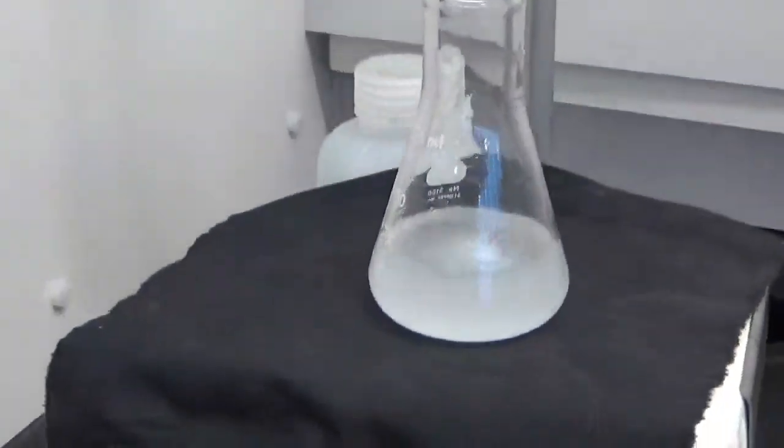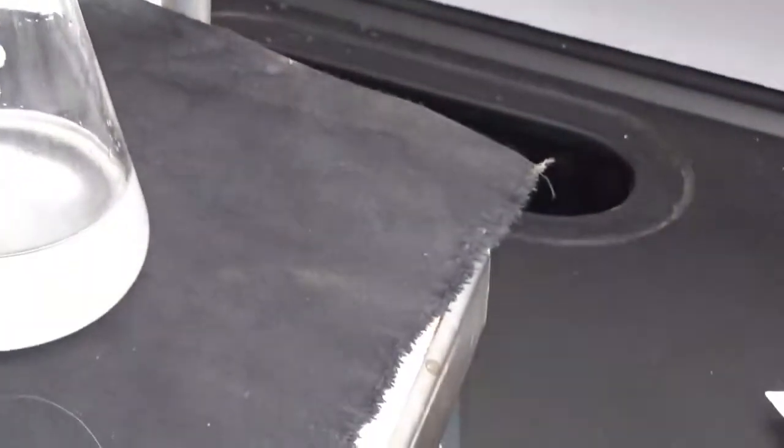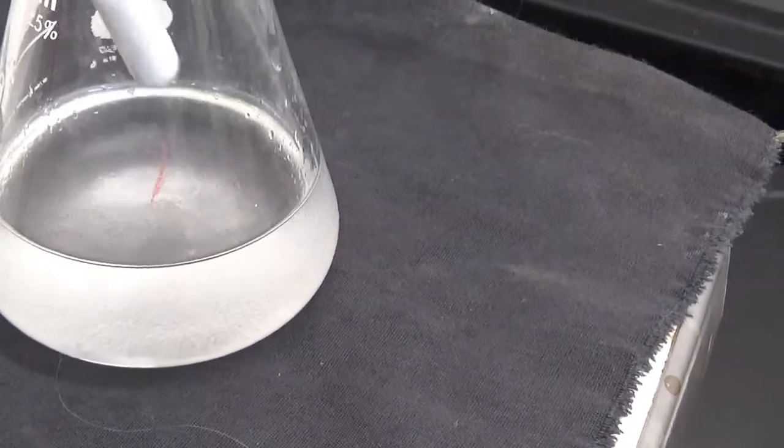Alright, so my mixture here has been stirring for more than 5 minutes now. I'm just going to shut it off, and then I'm going to remove that stir bar because that's just going to get in our way. Try to get all the strips off of it. Just leave it on the hood.